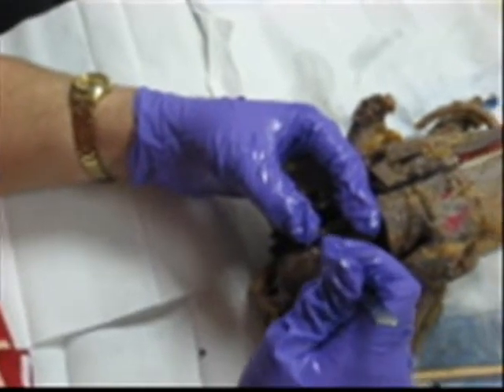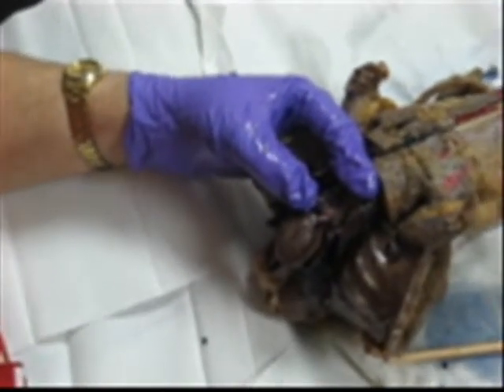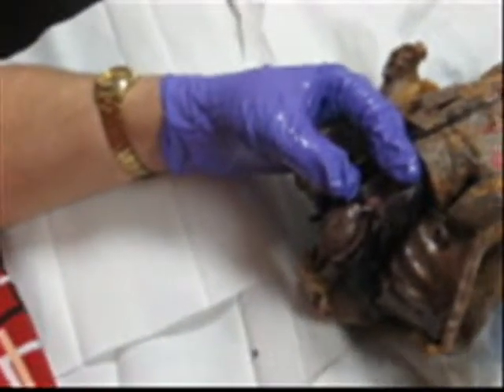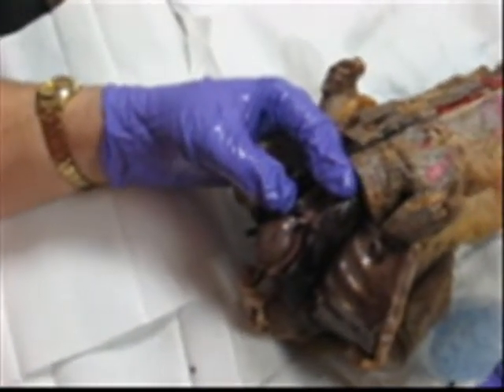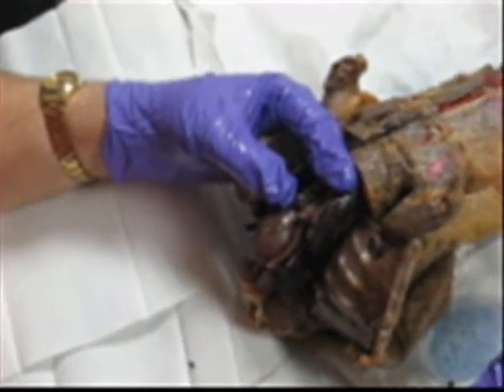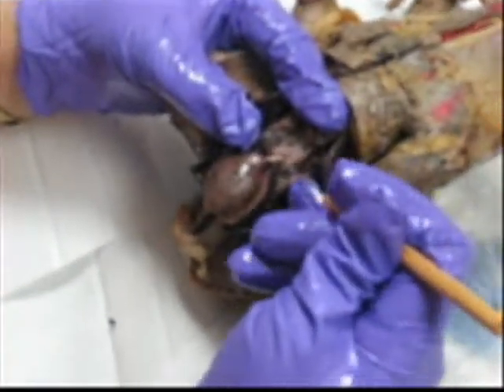What attached the aorta to the pulmonary trunk? What ligament? The ligamentum arteriosum — and that's why it's united.